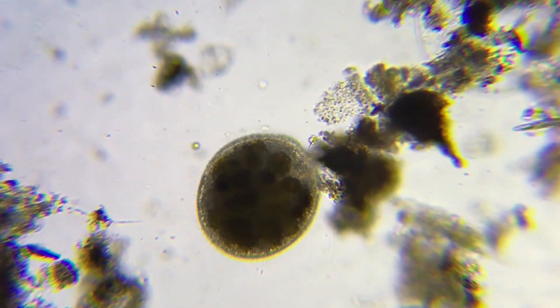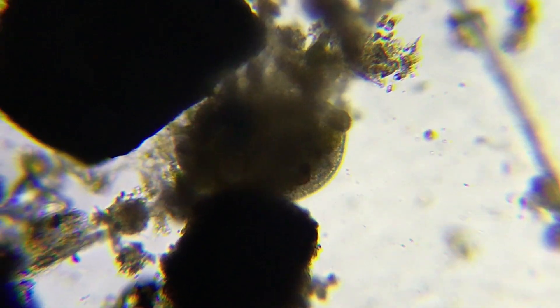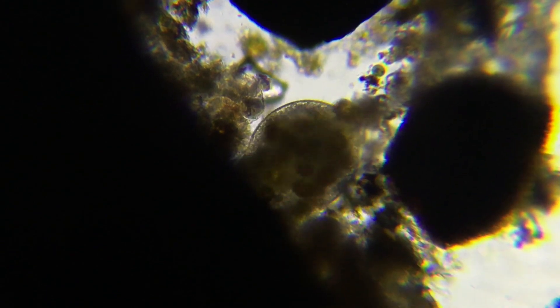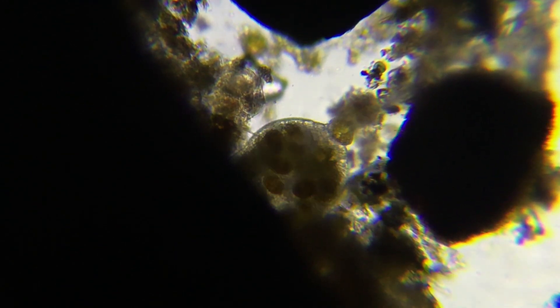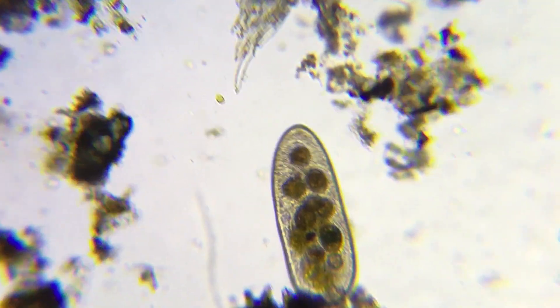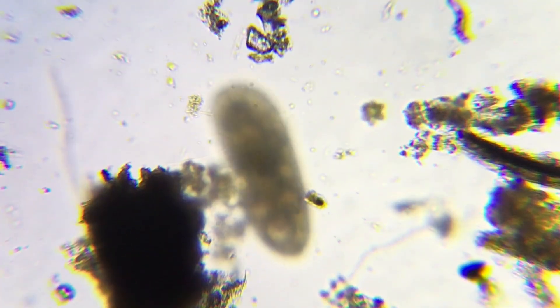We can't quite see the finishing. Here we have the same unnatural ornata pooping, and it's spit up twice. I like how it's shoving its front into whatever that is we can't see — it's just black. It looks like it's embarrassed. We don't know what this is, so if you know what it is, please leave what you think it is in the comments.